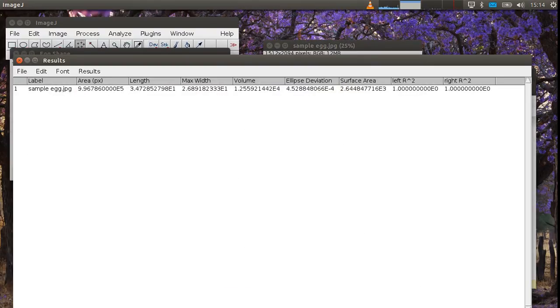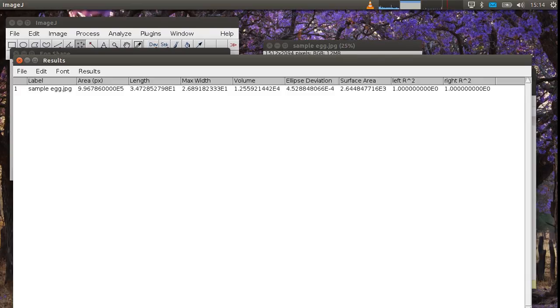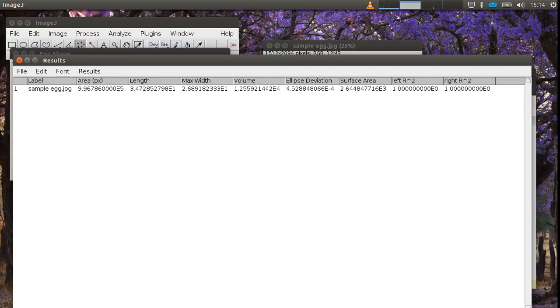And so now it's calculated the metrics of the egg that we're interested in. In the results table first you have the name of the image so that you can just keep doing more and more images. The area in pixels in the photo of the egg. Probably not very useful. The length of the egg in millimeters. See here it's 34 millimeters. The width of the egg. The volume of the egg in millimeters cubed.